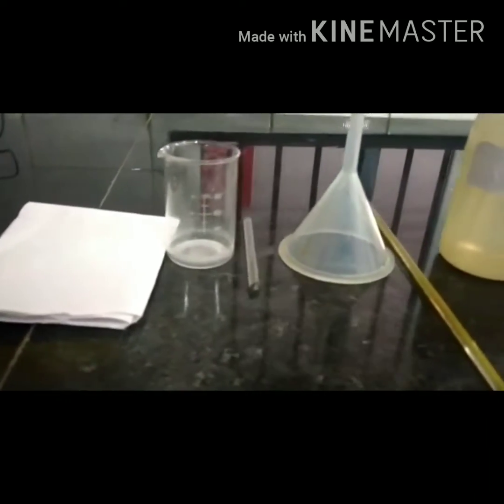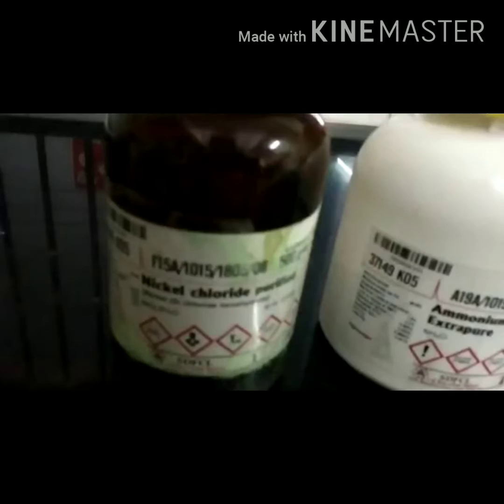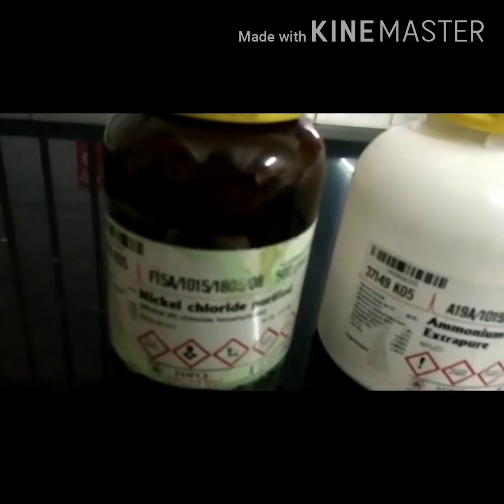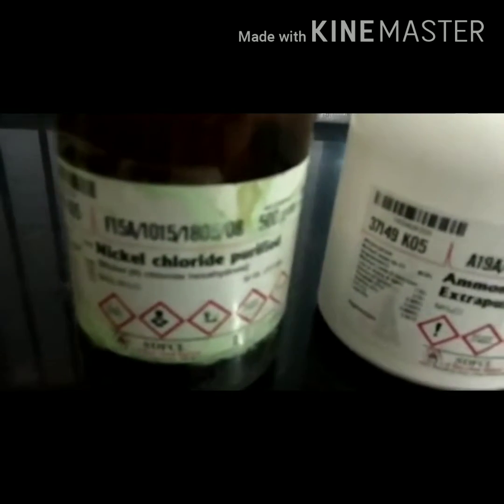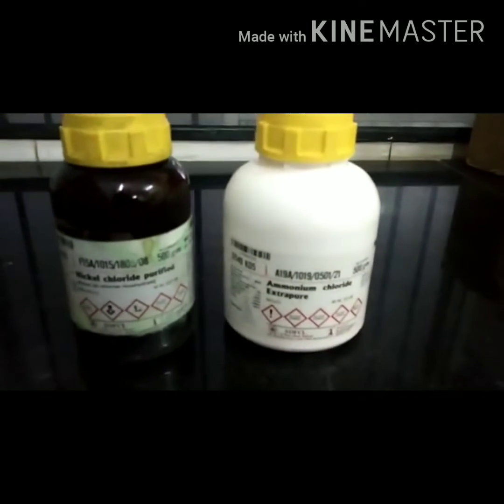Preparation of hexaammine nickel(II) chloride. Apparatus required: filter paper, beaker, glass rod, funnel, and distilled water. Chemicals required: nickel chloride, ammonium chloride, and ammonia solution.